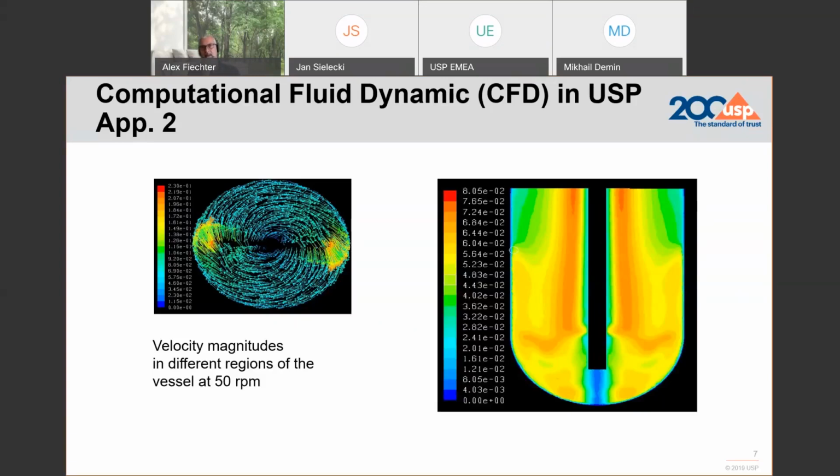So imagine if you are forced to dissolve active principle from a dosage form where it's seated and not really well agitated, probably the release rate is a little lower than if it were placed anywhere else in the vessel. So considering that fact, for some of the developers of dissolution methods, this plays a critical role.